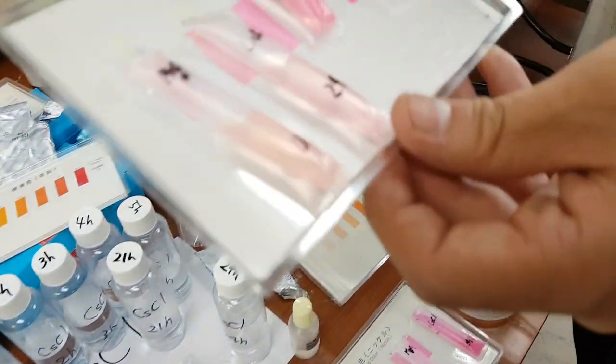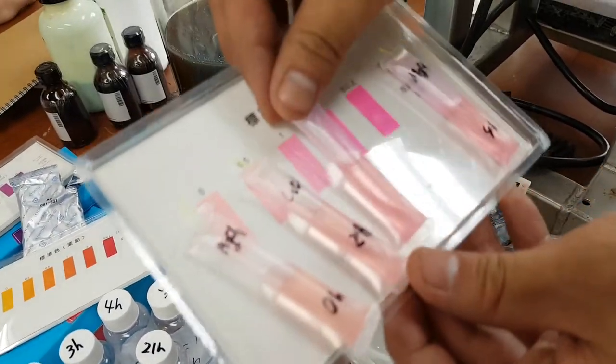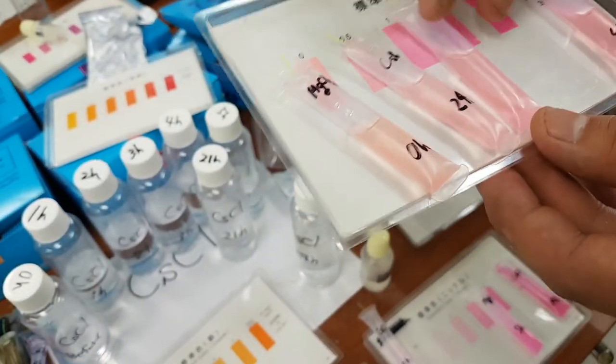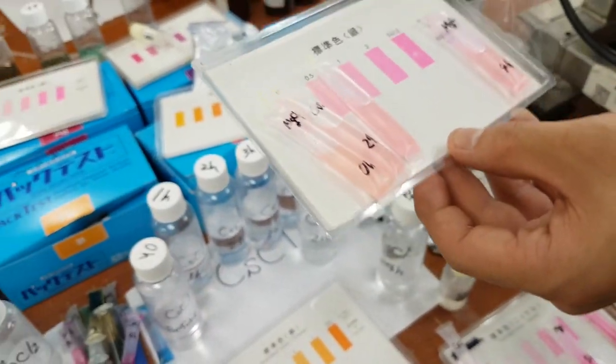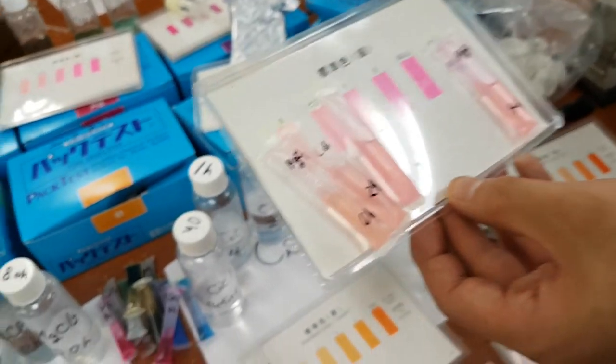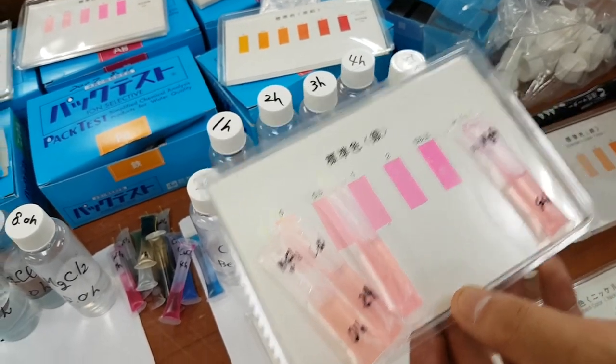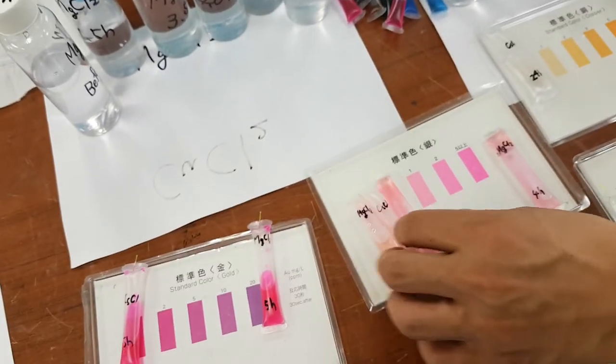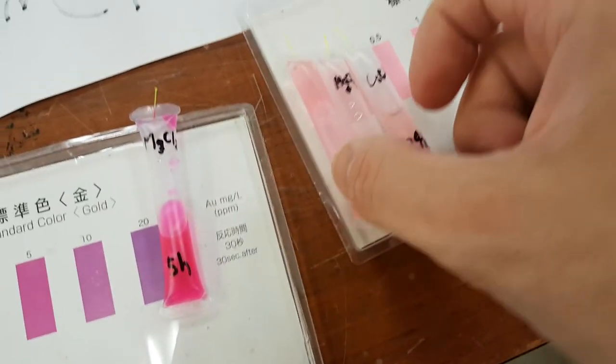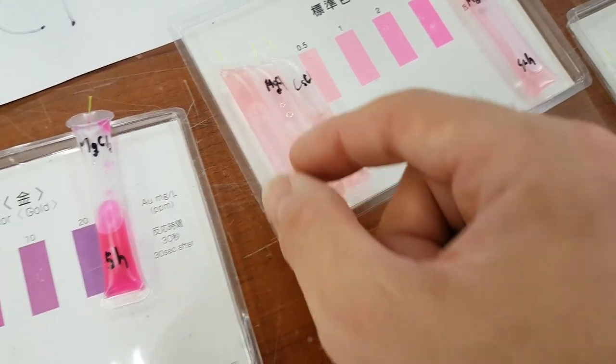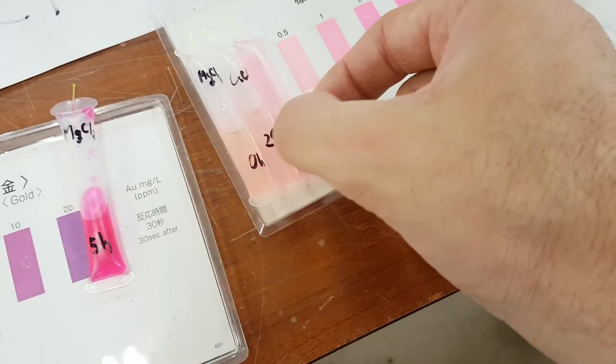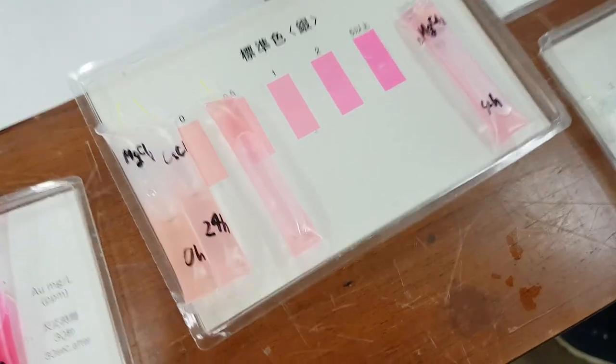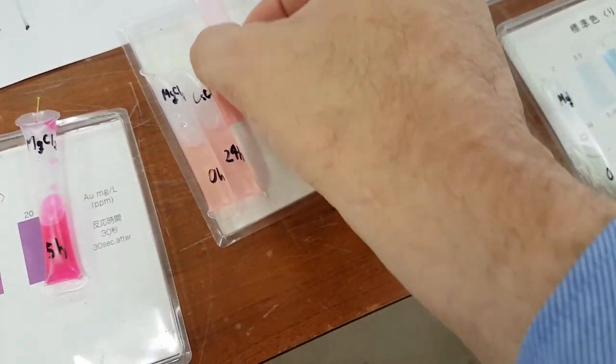It doesn't come out. Yeah, well, I don't know. What would you say? It does look a little different to those, doesn't it? I don't know. The iron is growing more.